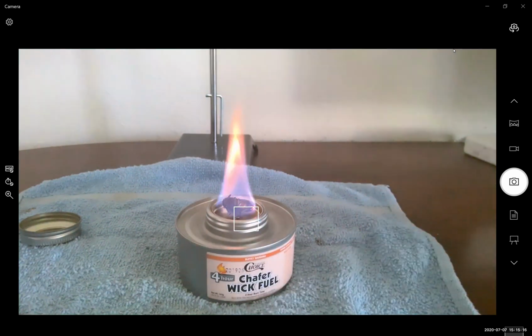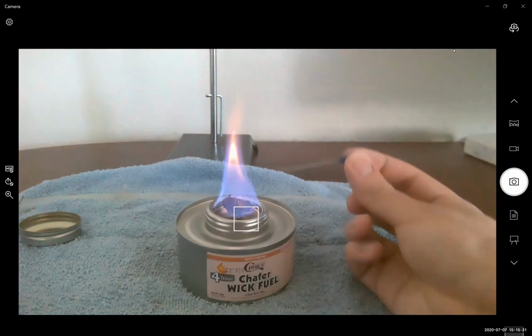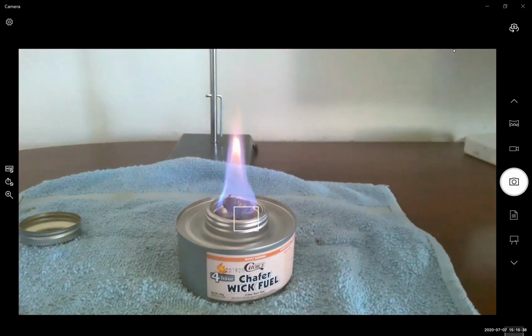It's really subtle for this one because I didn't make a very concentrated solution for copper. You can see it, it's subtle. Okay, perfect. So that's, as a bonus, the emission of copper. A lot of these elements are used as additives in fireworks in order to create unique colors. So with this experiment, we have completed our analysis of all of our samples.